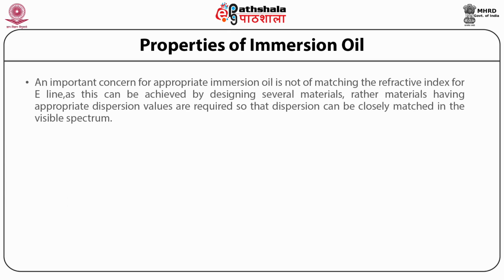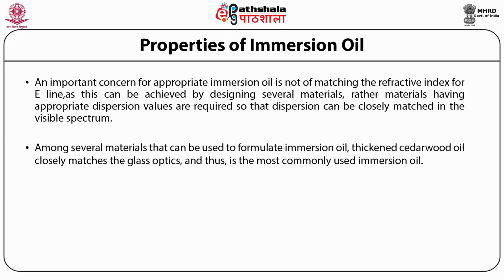An important concern for appropriate immersion oil is not matching the refractive index for the e line, as this can be achieved by designing several materials. Rather, materials having appropriate dispersion values are required so that dispersion can be closely matched in the visible spectrum. Among several materials that can be used to formulate the immersion oil, thickened cedar wood oil closely matches the glass optics and thus is the most commonly used immersion oil.